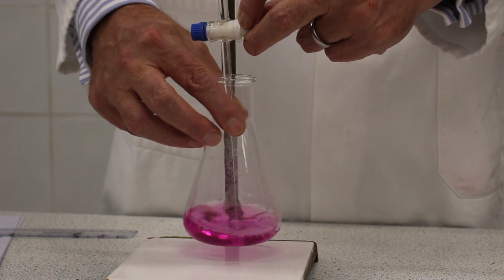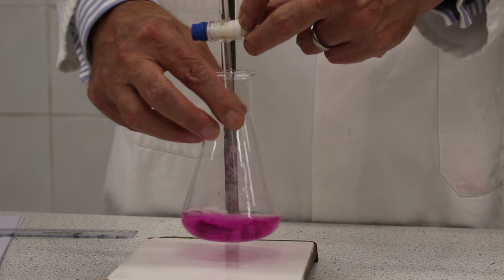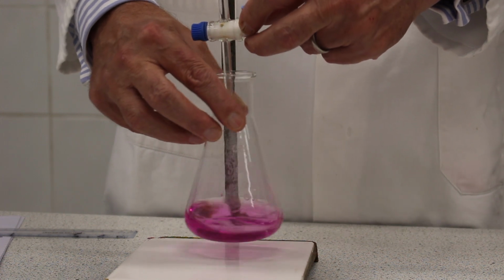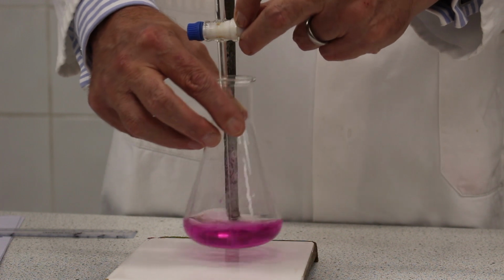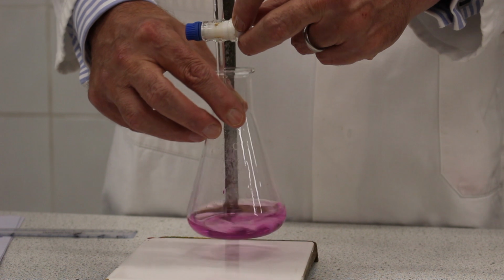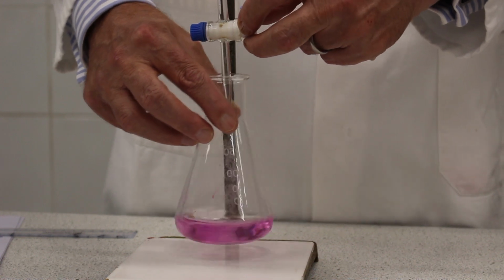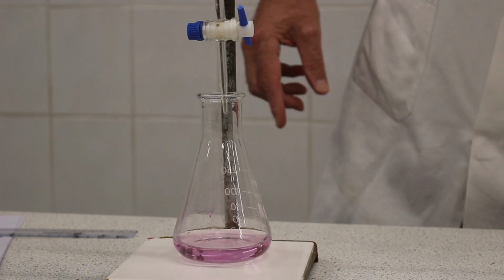Now Mr. Firth is carefully adding the acid, and he's going to add the acid until the indicator changes colour. As he carries out the experiment, you can see that the indicator is starting to lose its pink colour, and this is indicating they're getting close to what we call the end point, the point of neutralisation.